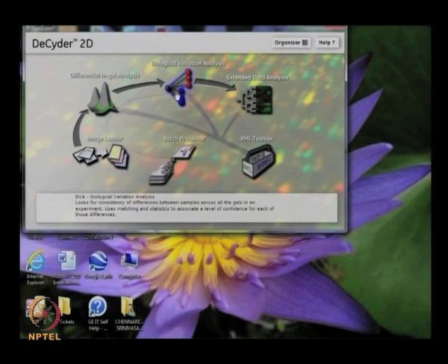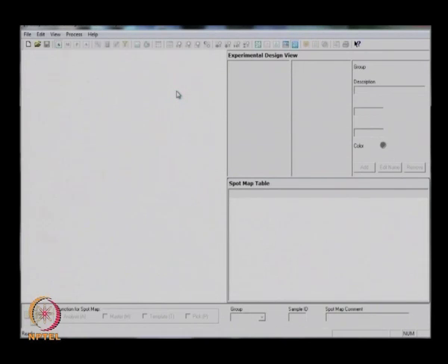This is the BVA. BVA is nothing but biological variation analysis. One of the internal standard images is selected as a master image and all internal standard images are matched to this. The standard spot ratio of each protein in each sample is then compared, giving t-test values, fold changes, and ANOVA values for each and every protein. How to create a BVA workspace?